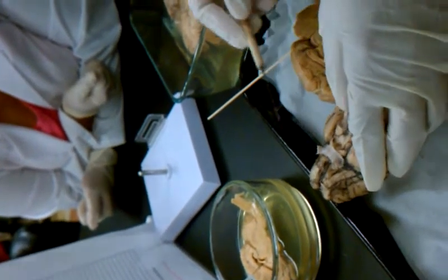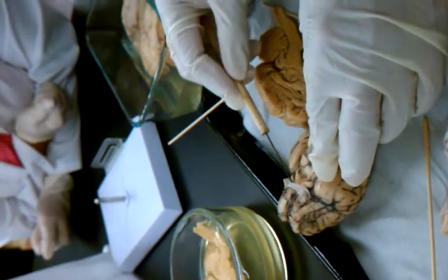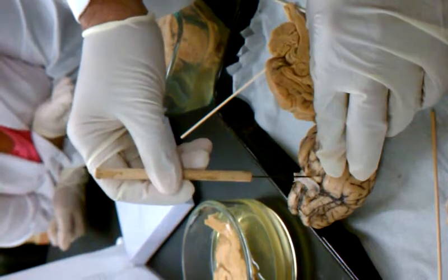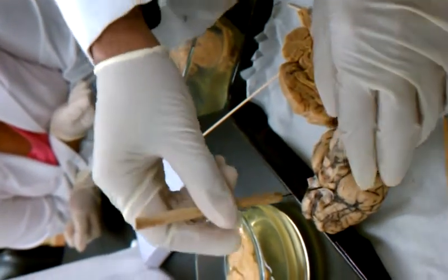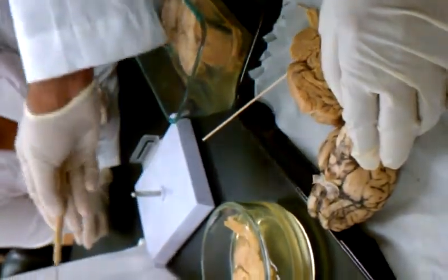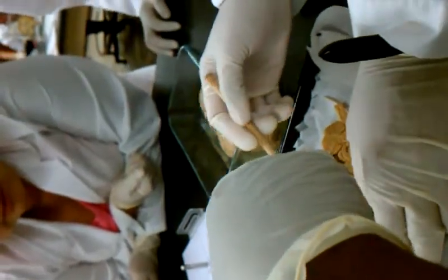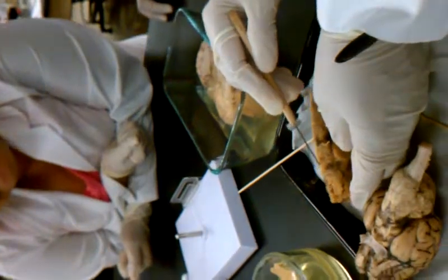Optic chiasma. Yeah, this is your optic chiasma. Is that the X? Yeah, X means the middle of the X, not the whole X. Okay. Right in the middle. See? Okay. And which one is that? Optic chiasma. Okay. 17. Okay. And if you're looking at it from in here, can you see it from here? This right here, right? Yeah, this one. Okay.